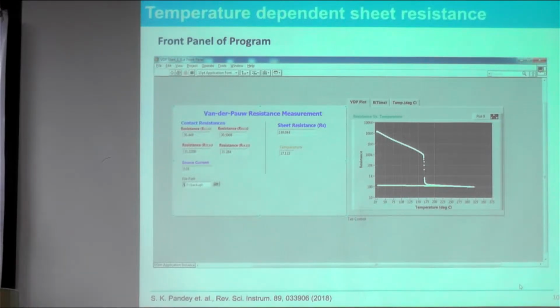So we can get the crystallization temperature with this, and you can also get the resistivity contrast for your chalcogenide based material. So this is the overall setup by which we can see the change in resistance value and the crystallization temperature. So this is the overall thing related to your temperature dependent resistivity measurement setup.